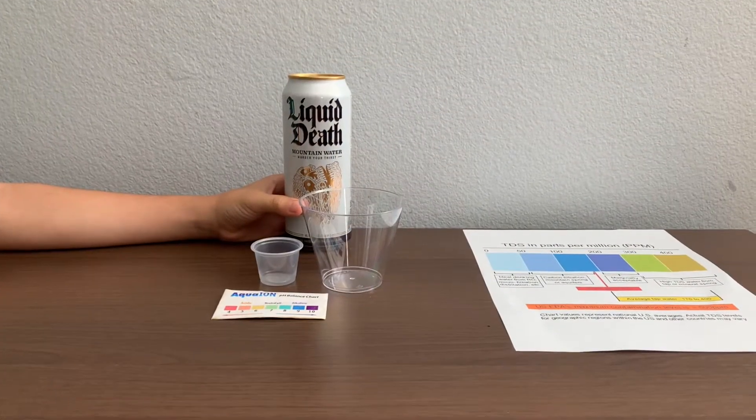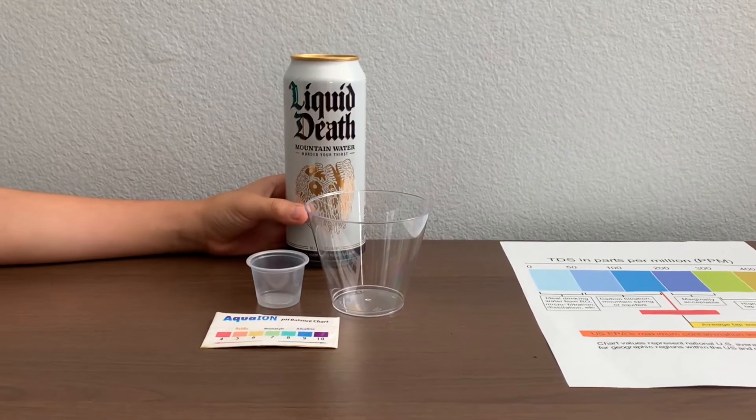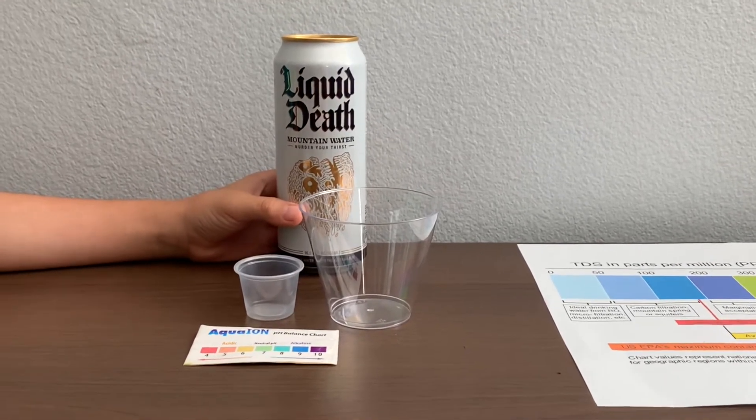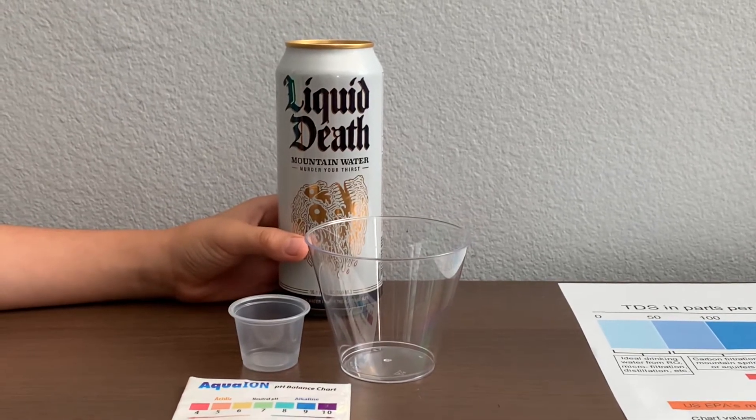This is Liquid Death Mountain Spring Water from the Austrian Alps. It's sold at Whole Foods Market. Liquid Death Mountain Spring Water costs $1.69.